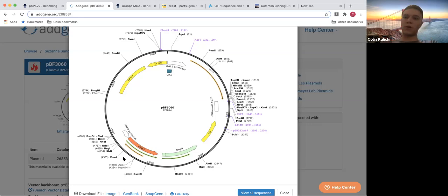That's how that experiment thought process will kind of go. And that's how you select for things that maybe already have built-in resistance. So you got to be, again, very smart about it. You got to be thinking about what kind of species am I putting it in. If I put only ampicillin resistance, my selection markers aren't going to be totally accurate. That's how that's going to work.